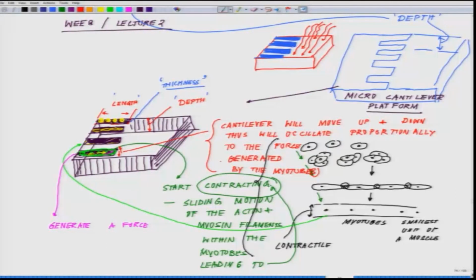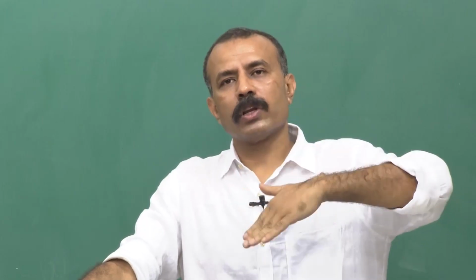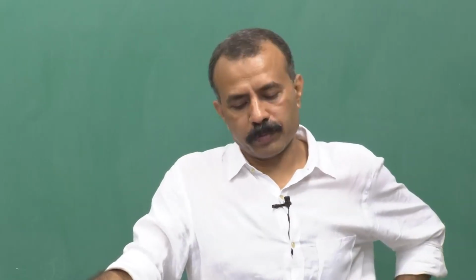Depending on the force generated by the myotubes, there will be a certain oscillation happening here.